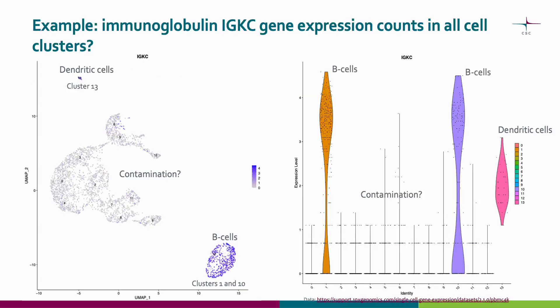We will take a look at an example to get an idea of how the CellBender background removal method affects downstream analyses. This is an example using single cell gene expression data from peripheral blood mononuclear cells. We have not removed any background contamination counts from the data. We have identified some clusters and we know that the gene IgKC should be expressed by B cells. However, we see that all of the cell clusters express IgKC, so some of it could be contamination.